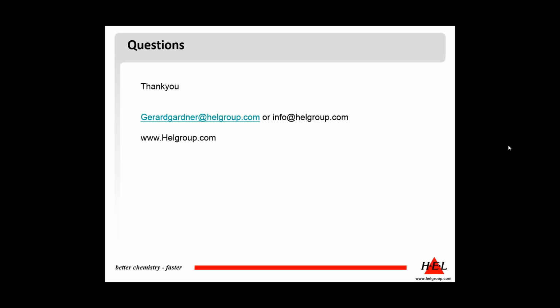There's a question about a BlueSense analyzer with your system. Yes, this can be integrated. For those who don't know, BlueSense is a gas analyzer system currently on the market. We can integrate that.